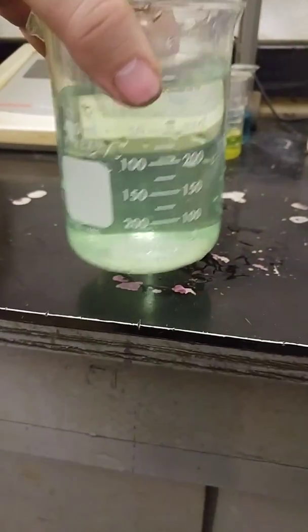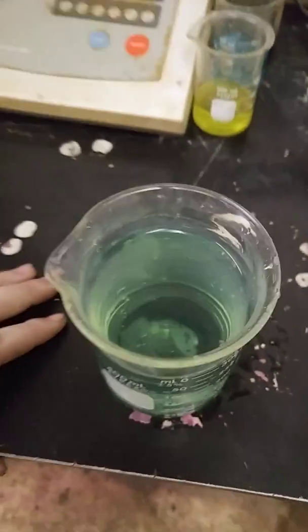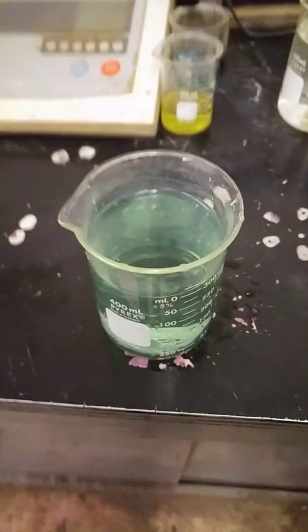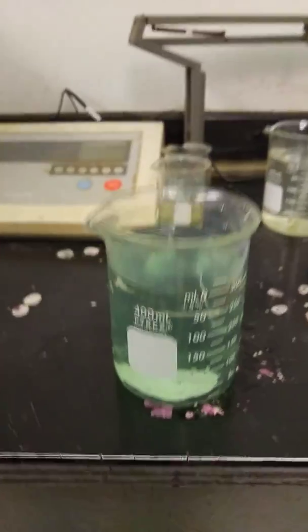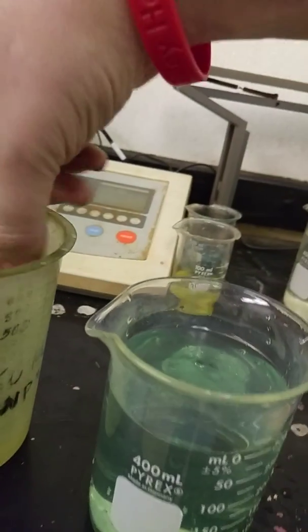The water is decently clear and as you can see it's in a liquid state. But I want to show you what happens when you add just a few drops of this ENP number 2 to it.